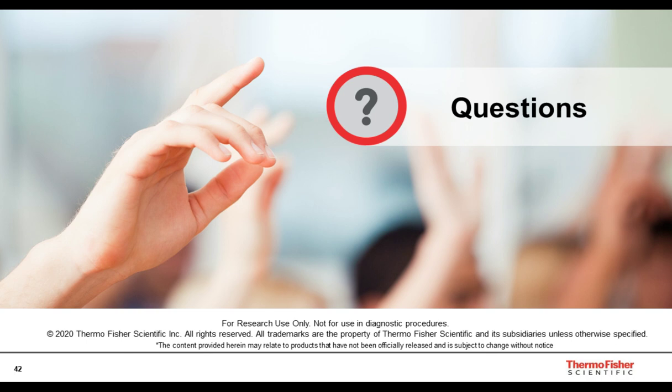Okay. I'm going to try and squeeze in a couple more here. All right. For your knock-in, are you sequencing the results to check for errors in the junctions?